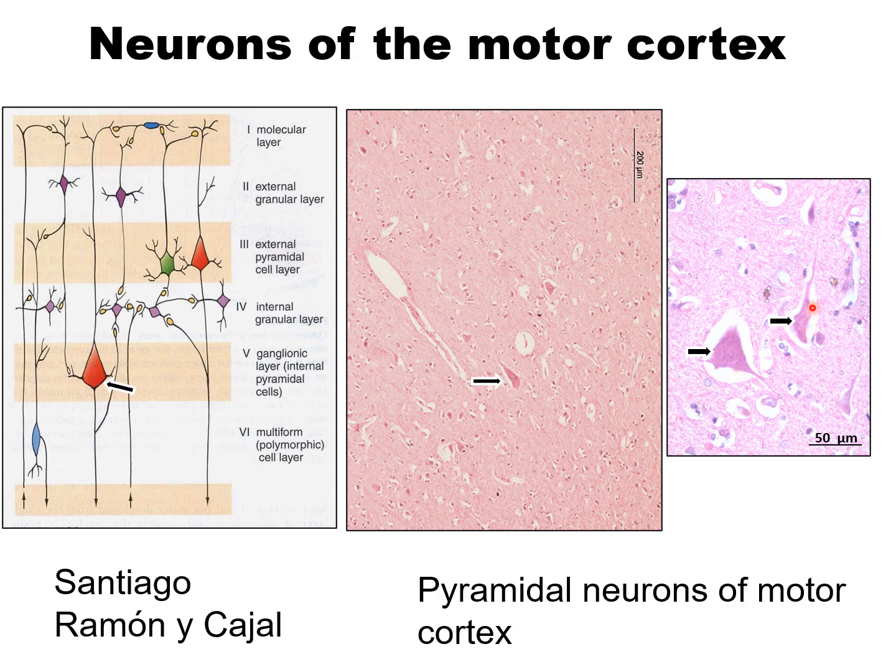This is another one where you can identify some part of the apical dendrite, and this is in layer 5 of the cortex. These white spaces are the blood vessels, and small nuclei are the nuclei of the glial cells. These areas which contain the glial cells, fibers and the blood vessels are called neuropil.